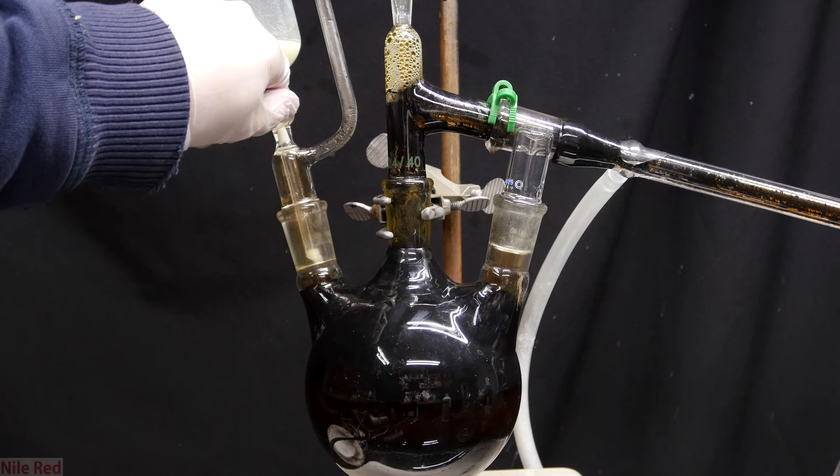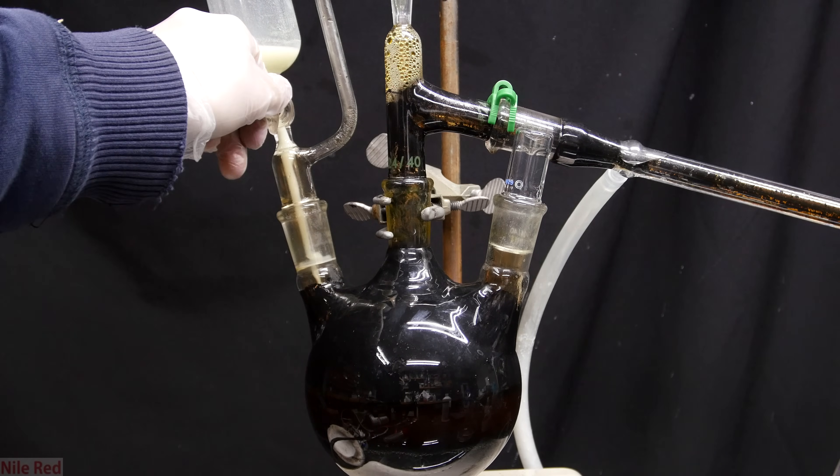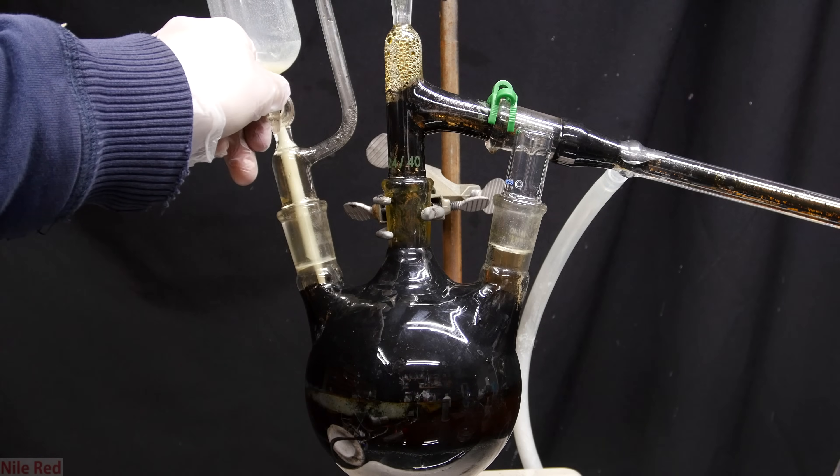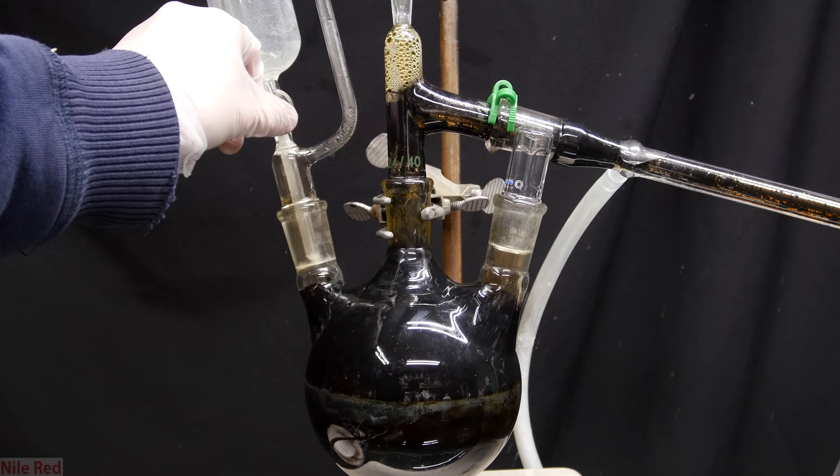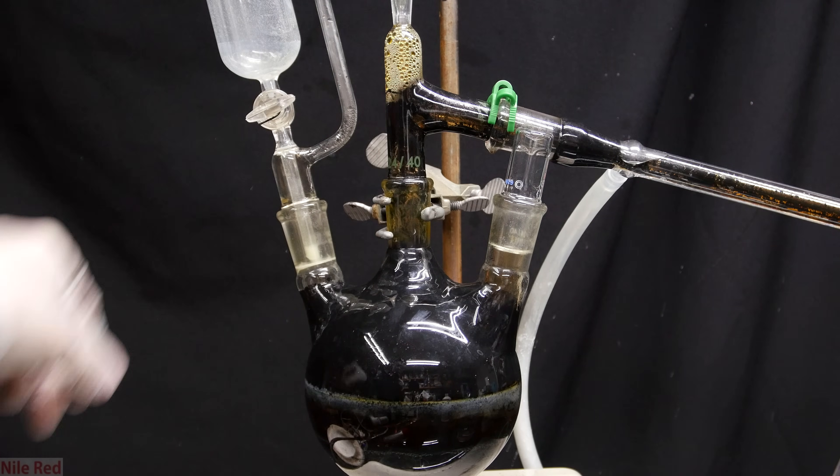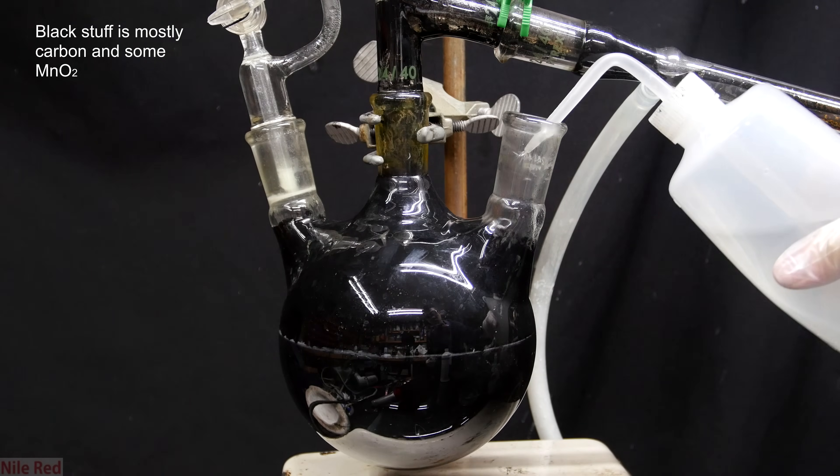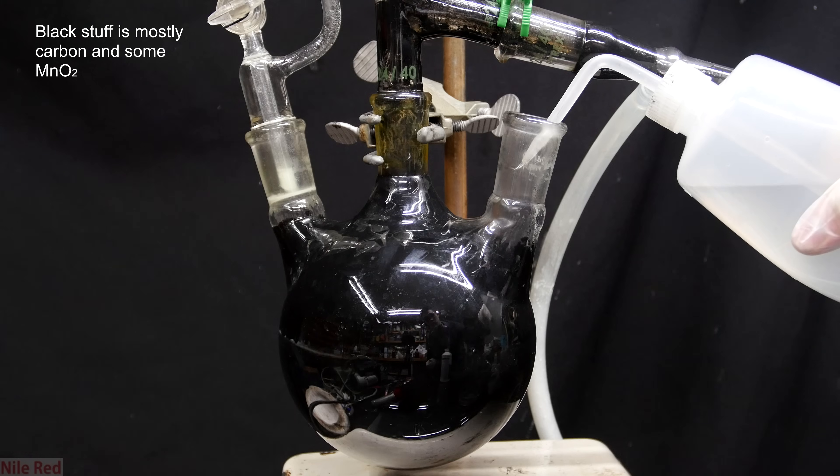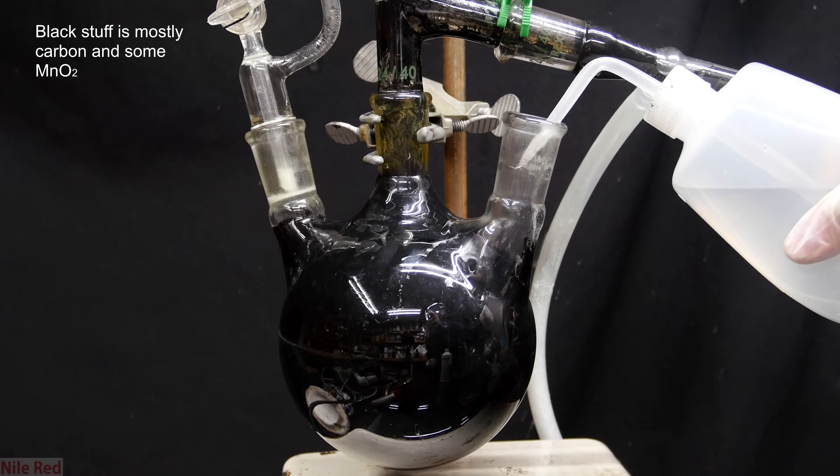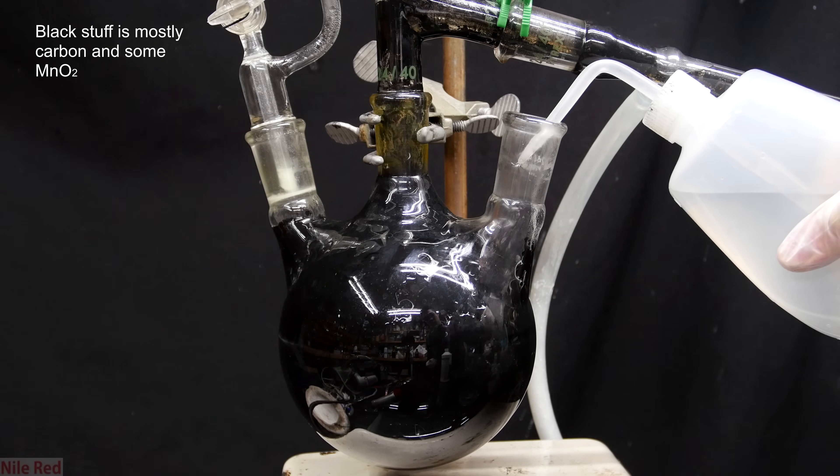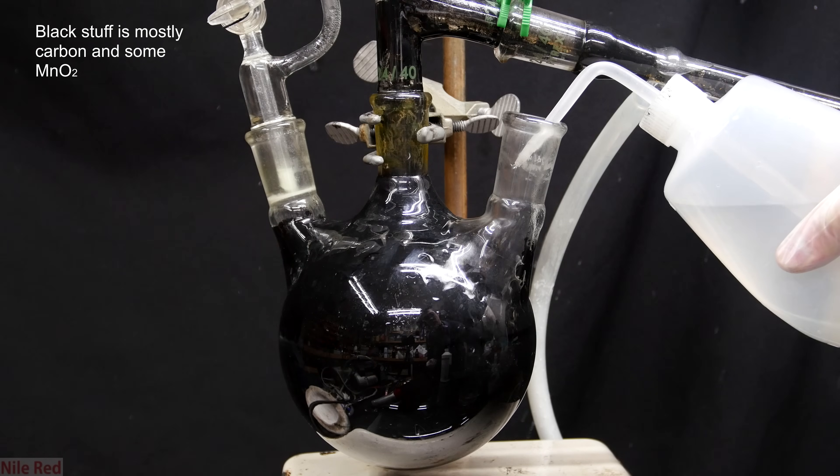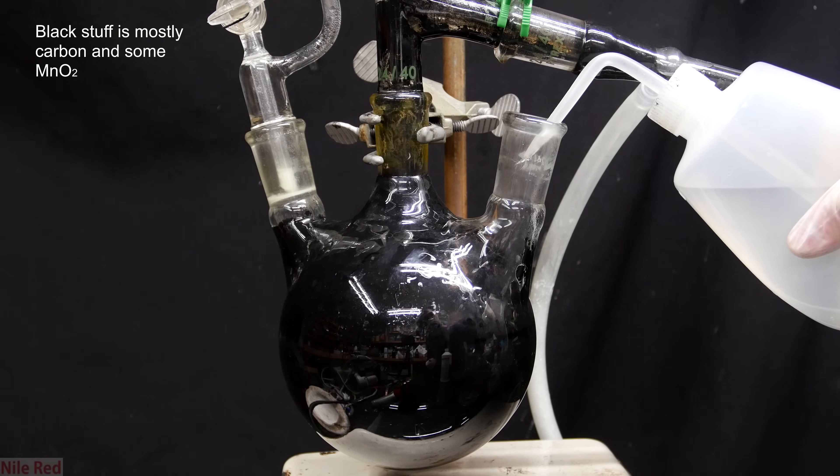Now we need to neutralize the contents of the flask. To do this, we start off by adding the sodium thiosulfate solution that was in the addition funnel. Surprisingly, there wasn't much bromine left over so that small amount of sodium thiosulfate solution actually neutralized it all. I then just use a squirt bottle with some water to clean off the walls and we can see that there's no orange bromine vapor.